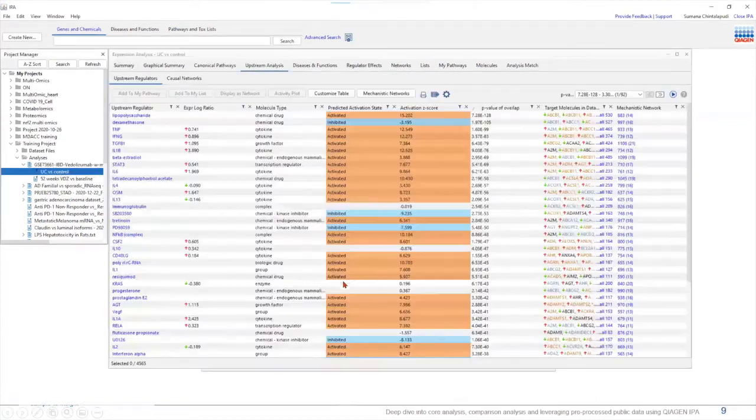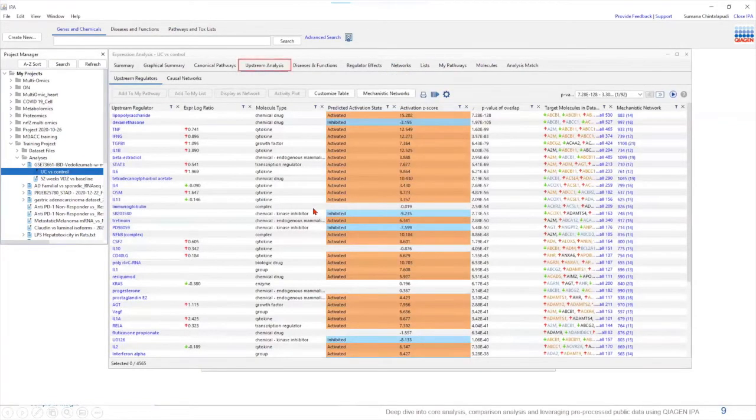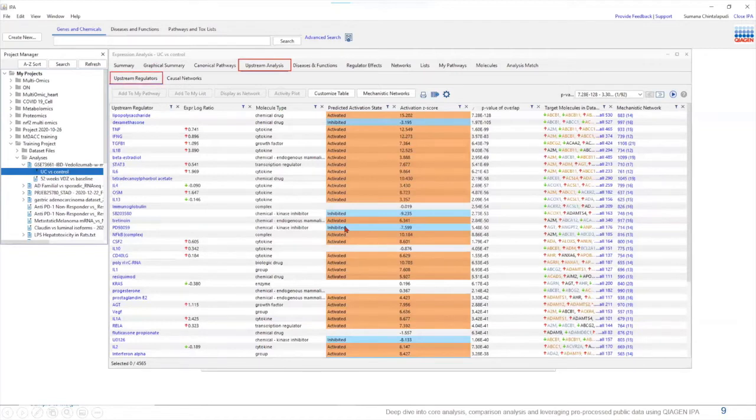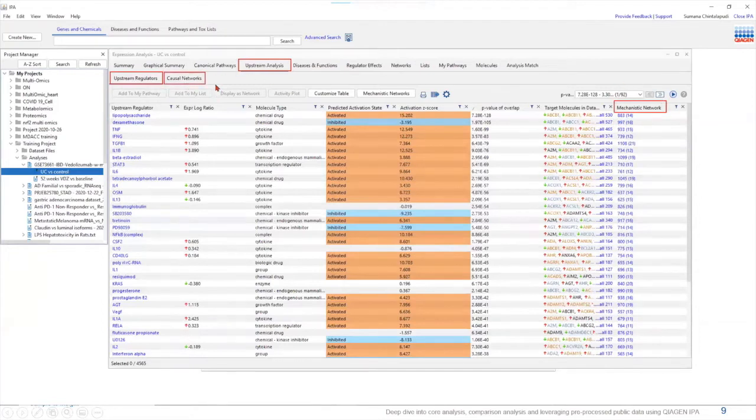Today we are going to look at the upstream analysis tab within our core analysis and here is a table listing individual upstream regulators and in addition to that we have mechanistic networks and the causal networks tab as well.